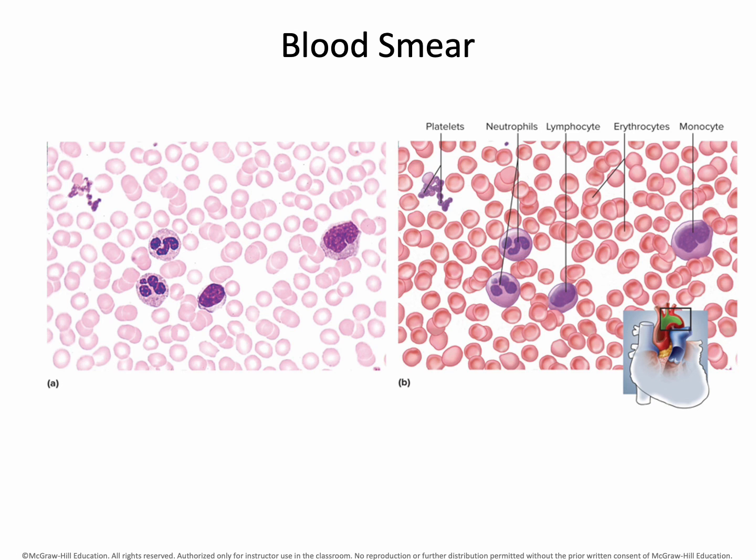Again, blood is where you see a smear. The liquid is just kind of spread out. There's really no staining. Sometimes there's staining for the leukocytes, but there's really no staining for the erythrocytes. They're already pigmented.